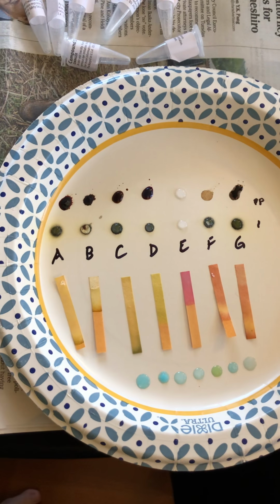So in conclusion, narrowing it down using these tests can be a little bit difficult because it can be subjective. Like, did it really dissolve? Did it not dissolve? Did it kind of dissolve? Is it purple? Is it brown? But for the most part, by using multiple tests, it's a little bit easier to narrow it down and be more specific. And making those predictions based on the structure also helped out quite a bit as well. So that's my results from Module 1 Lab.